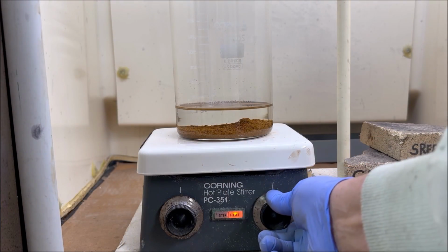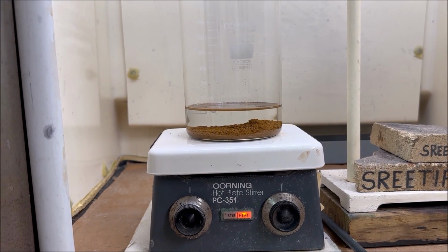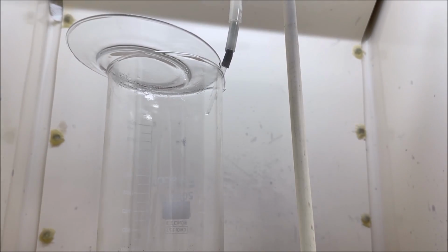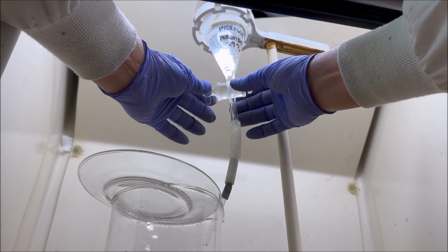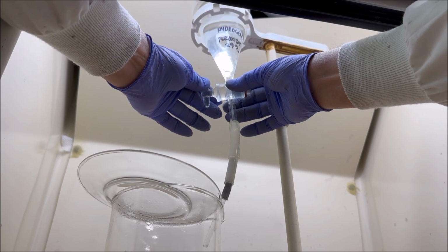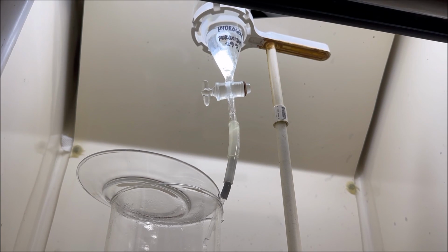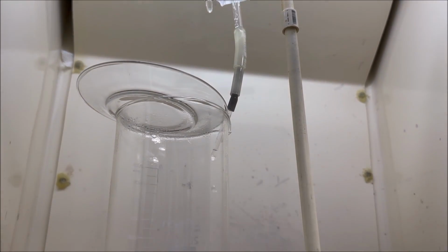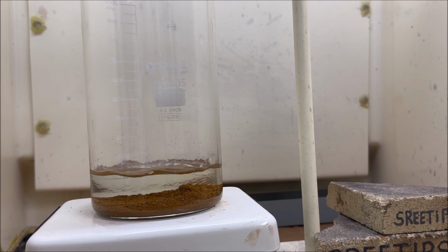Let's turn some heat on. This reaction takes quite a bit of heat. Now what I'll do is reach up here and we'll turn on some flow of hydrogen peroxide. Just a little bit. Just going to trickle it in there a little bit at a time. There we go. And I may even slow that down a little bit. What we'll do is we'll put this on time lapse and dissolve this gold a second time using hydrochloric acid and hydrogen peroxide.